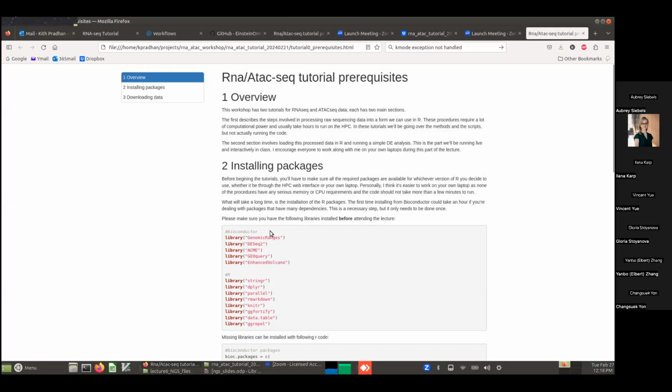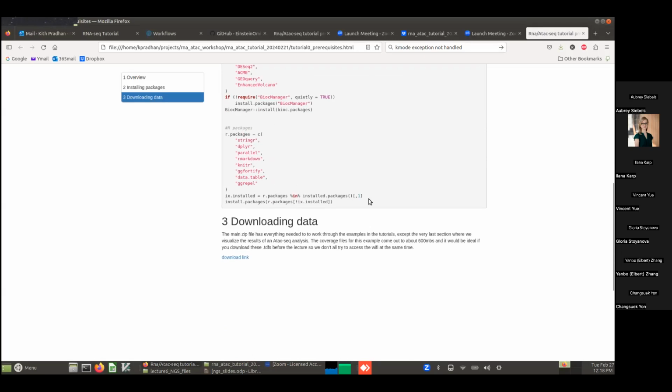Thank you. So at least try to start downloading these TDF files, these coverage files, if you haven't already, and have it downloading in the background, so when we finally get to that part, we'll actually have data to work with.